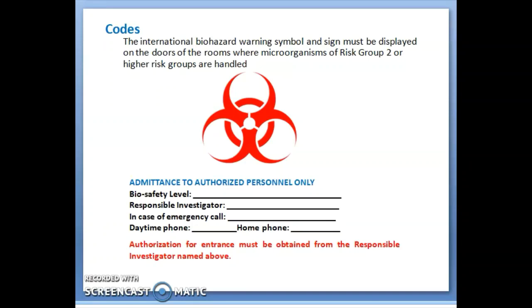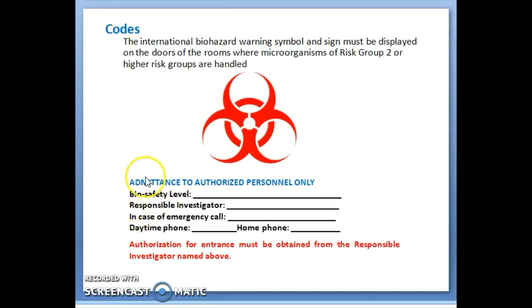The International Biohazard warning symbol and sign must be displayed on the doors of rooms where microorganisms of Risk Group 2 or higher are handled. Apart from the biohazard sign, an admittance card should also be displayed to restrict entry of unauthorized people. This admittance card contains information such as the biosafety level of the lab and the responsible investigator — for example, Dr. Haji Khan — along with emergency contact numbers.